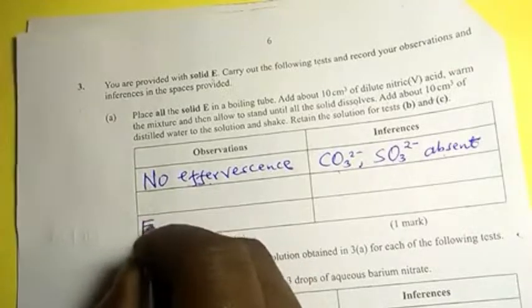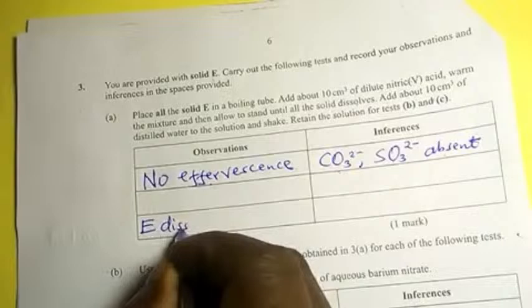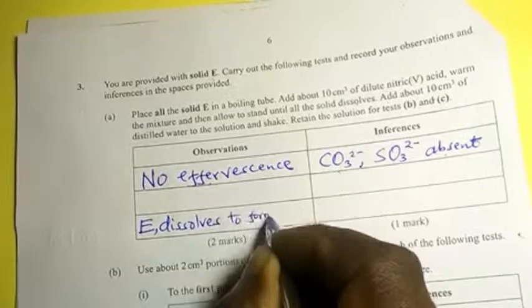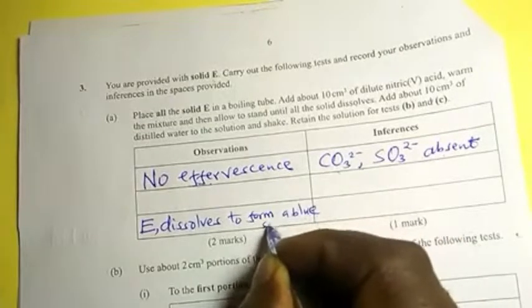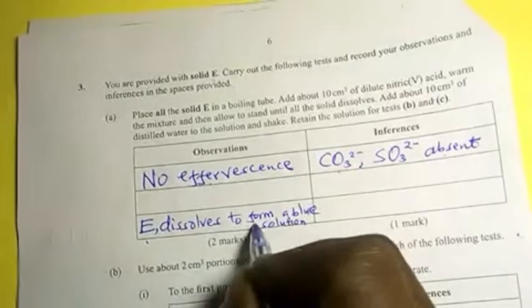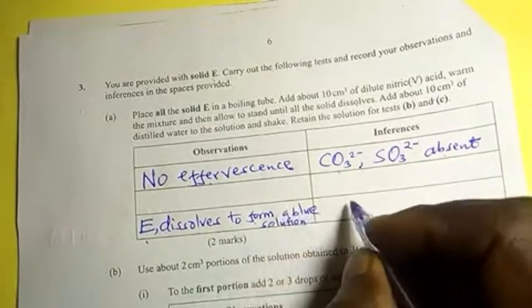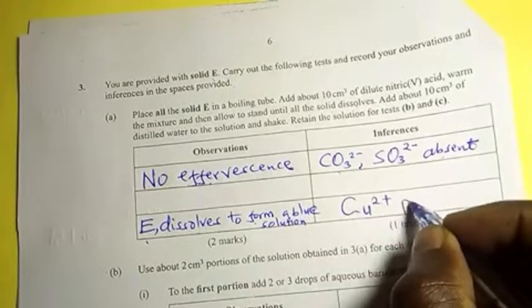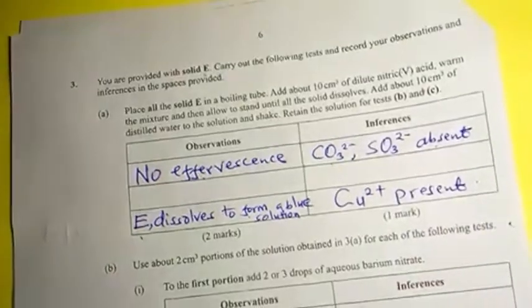Solid E dissolves to form a blue solution. So E dissolves to form a blue solution. Once a blue solution is formed, don't think twice. That one simply means the copper 2 ions are present. That's what it means.